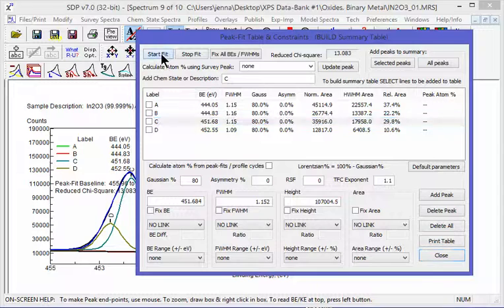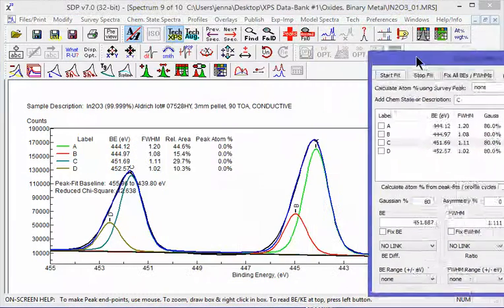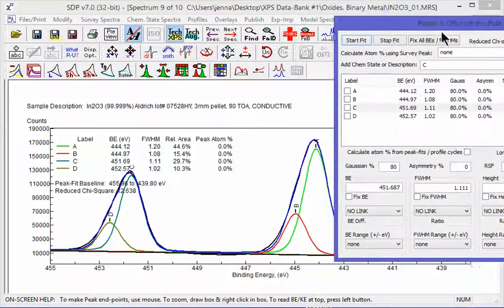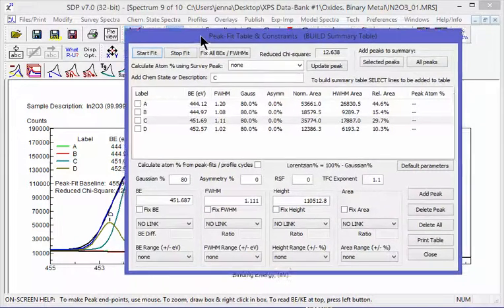Now we have to tell it to iterate again. Okay. We're using theoretical information to try to improve our results. It has shrunken a little bit. The fit up here is a little better. Fit down here is good. The fit down here is a little bit off, but unless you're really needing to go into the theoretical nature of the chemical, this is a sufficient result.